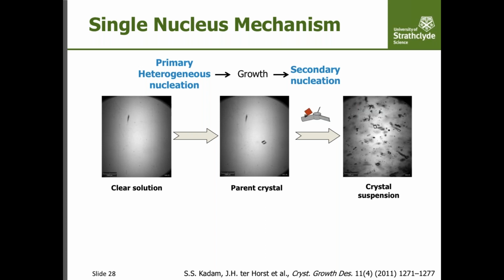So it's a two-step process where we nucleate, and then we need growth and secondary nucleation to detect the crystals.